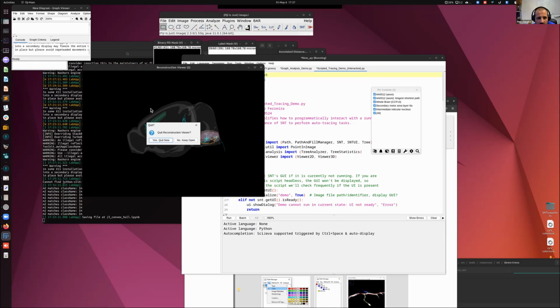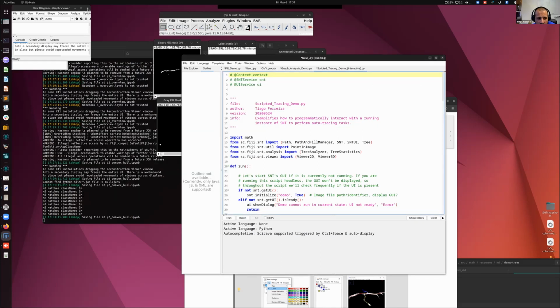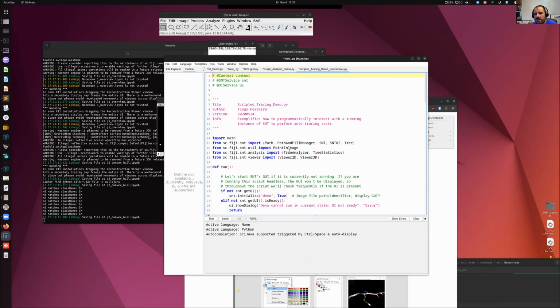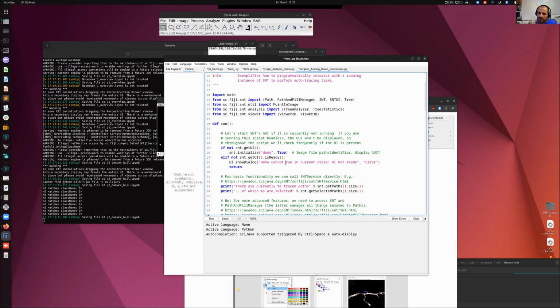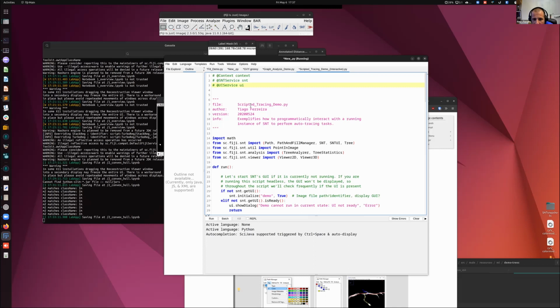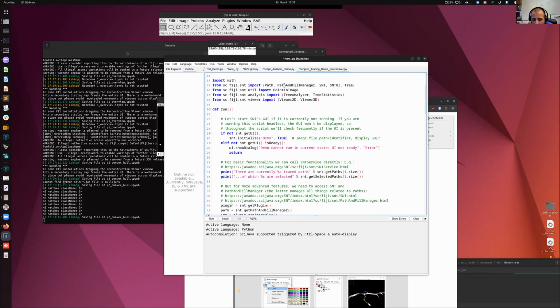The idea here is that this script assumes that you have traced something, you have done some searches by yourself, but you also want to blend that with some automated scripting, so automated tracing. Let's just go through the anatomy of the script. You have some parameters that define the services that are going to be required, and some imports, which are the classes that you need to access.